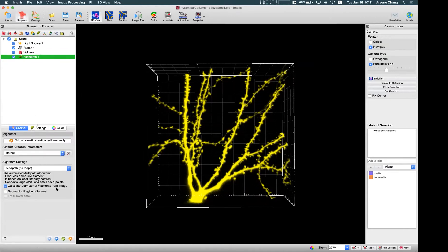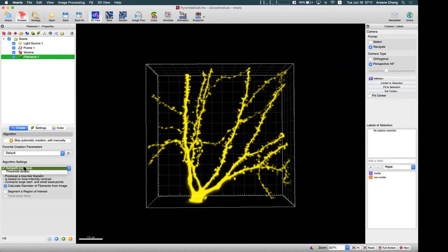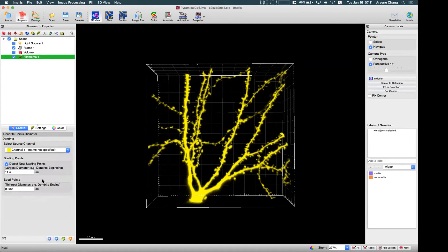In the creation wizard, we have two algorithms. For tree-like branches we use the auto path algorithm. If you're interested in the diameter of the dendrite, you can also check 'Calculate diameter of filaments from image.' Let's go to the next step.